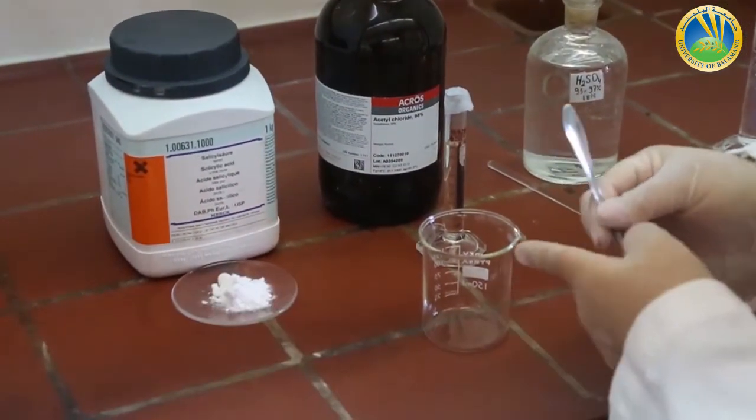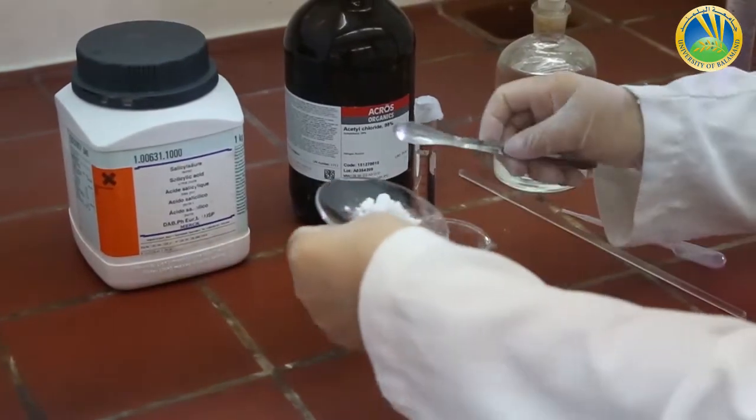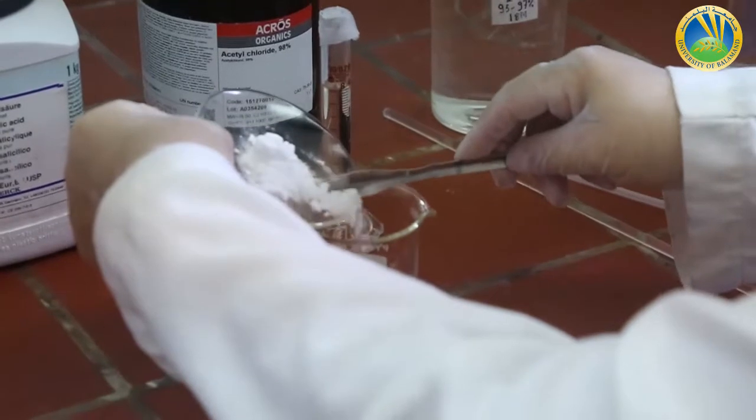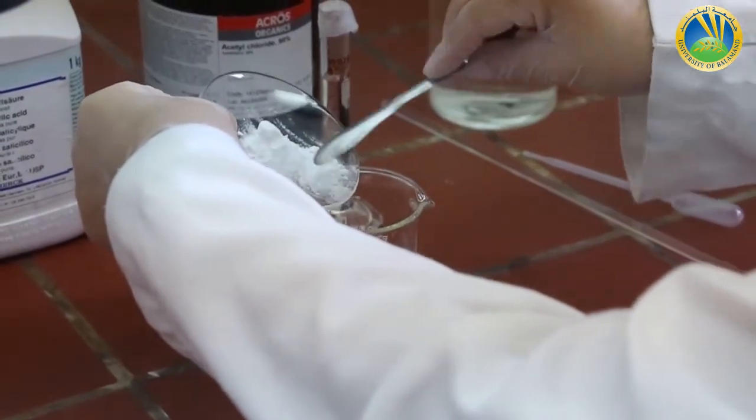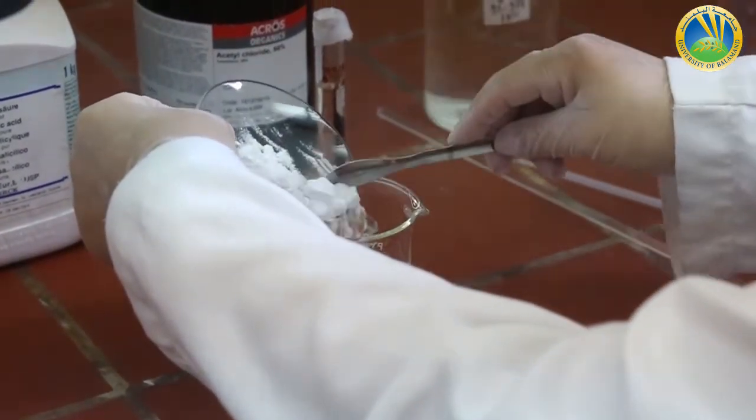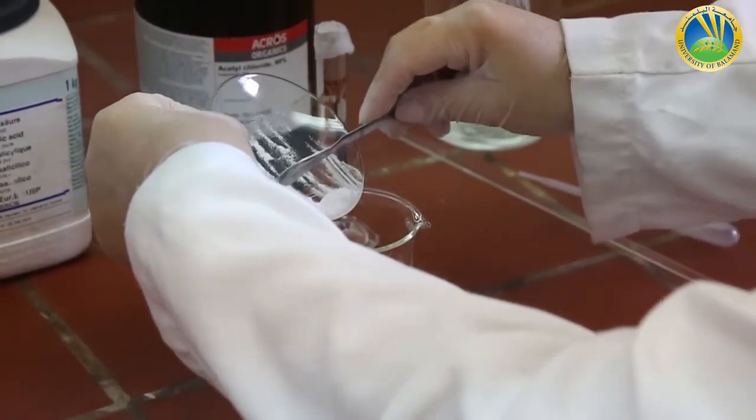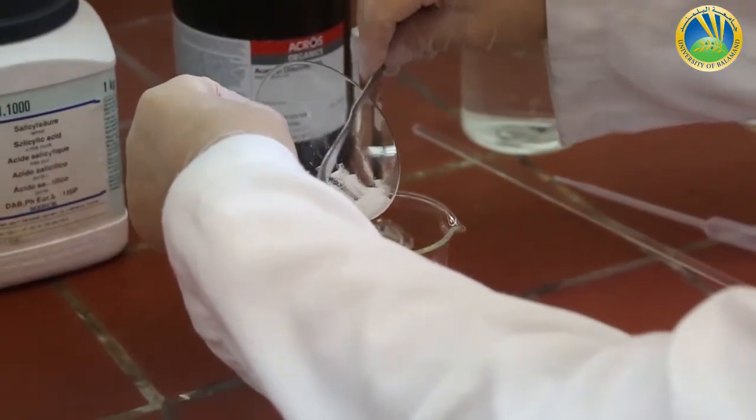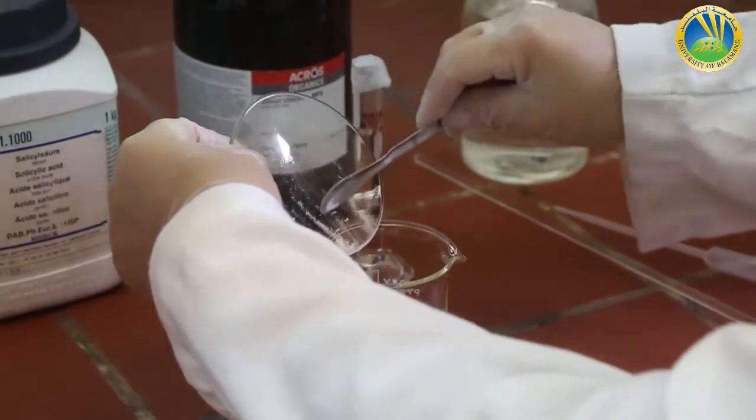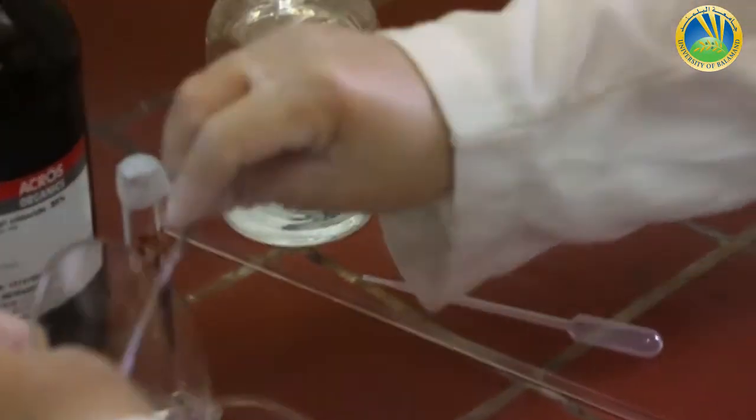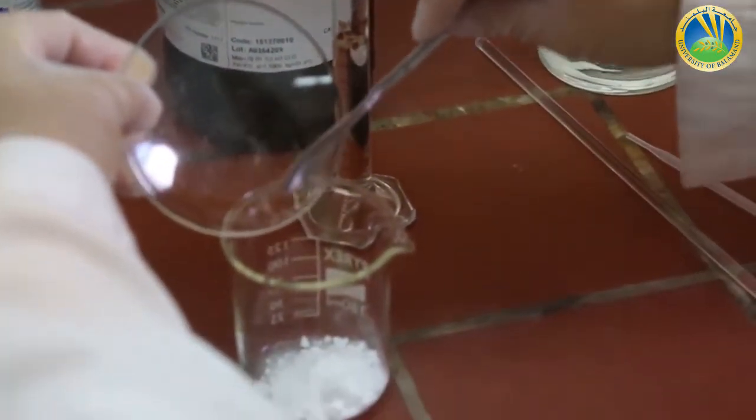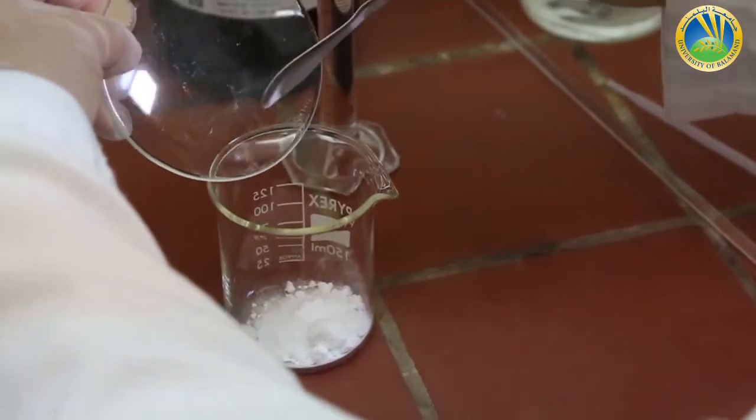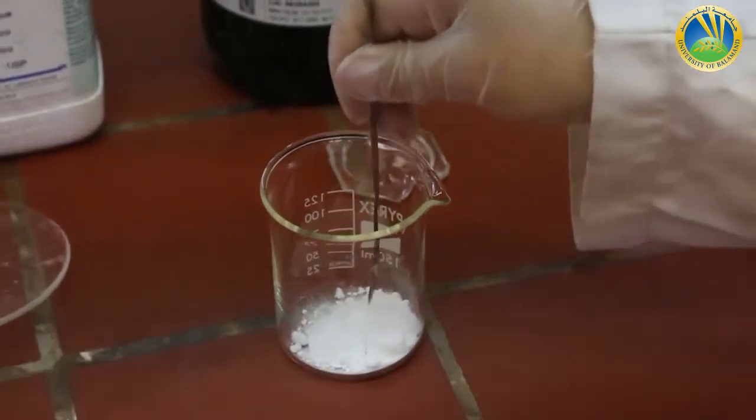I will introduce now in order the salicylic acid, 5 grams, into the beaker. I weighed it before I started.